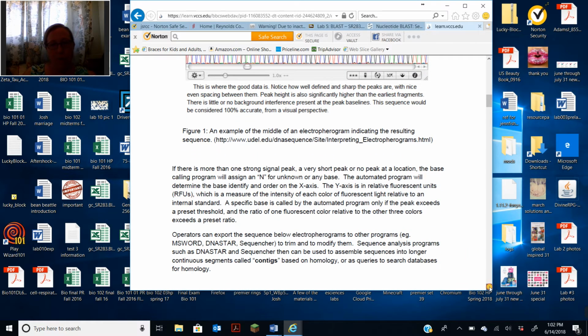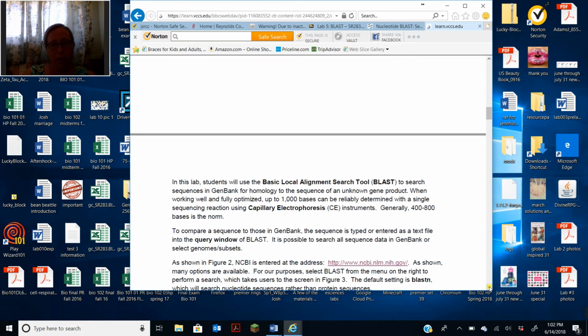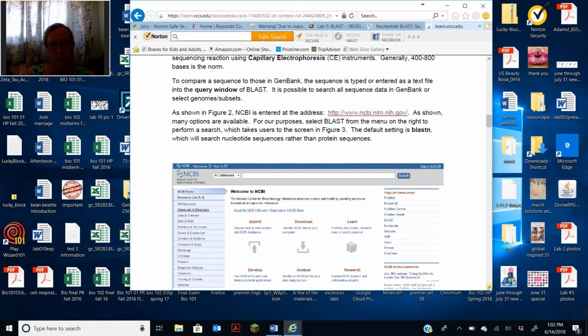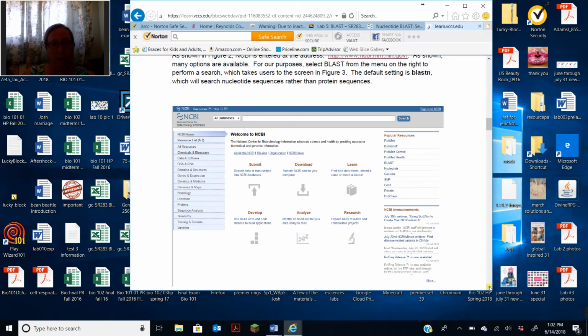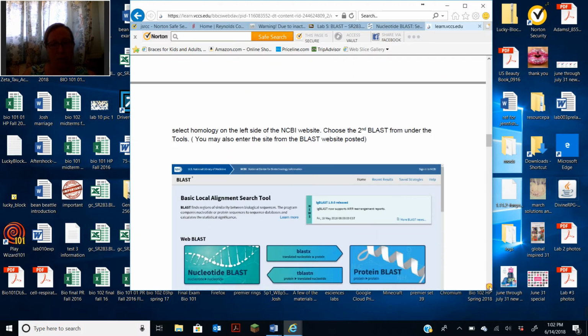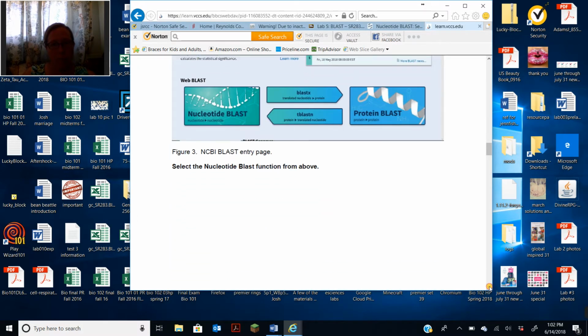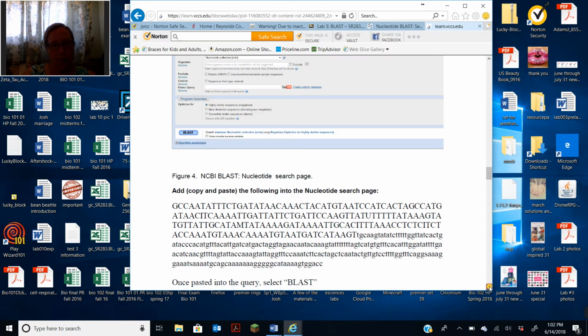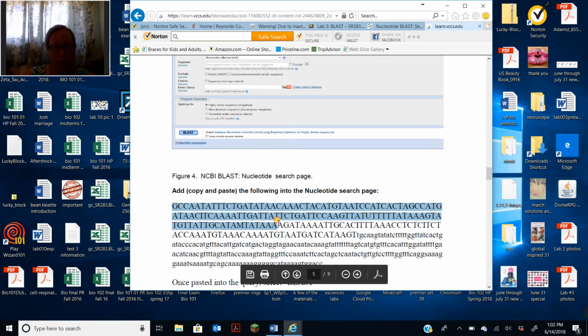You can keep going. You can read about that, and so this is if you're coming into the website from the beginning, and then the BLAST home page. That's where we just were. Keep going. That's the page that we're on right now. And so I'm just going to show you what this does so that you can do it as well.